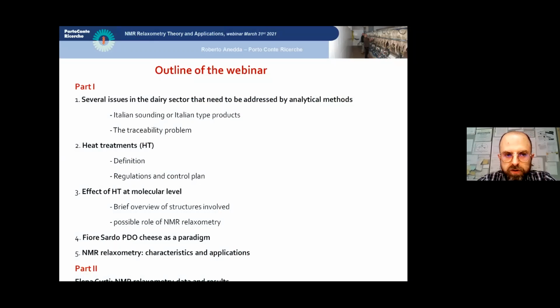And then I will talk about heat treatments in general, which are very important in this producing sector. A few words on the definition and regulations in force. Then I will talk about the effect of heat treatments at molecular level, especially for dairy products, milk, curds, and cheese. And of course, the possible role, and what we have found, on the application of NMR relaxometry in these very interesting systems.